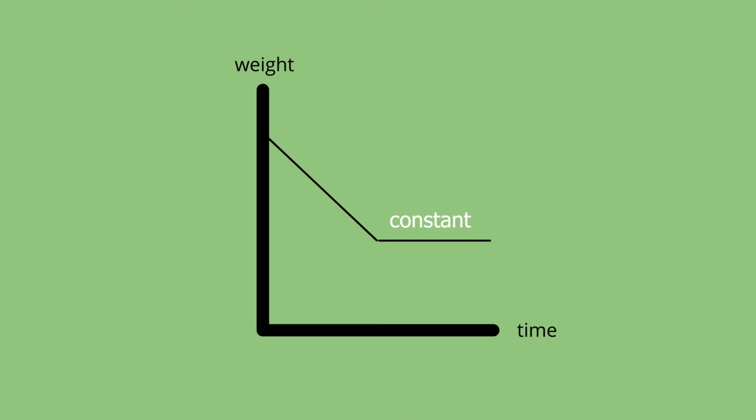Another one is the drying of the samples. The mass will go down slowly as time goes on, but it will eventually stop changing. That's because there's no more water. So we have to ensure that we dry the mass to a constant weight. Sometimes if you aren't looking at it for long enough, it could seem like it's just not changing. It might just be kind of fluctuating. Really, there might be a trend downwards. If we looked at it for a longer period of time, we would actually see that trend downwards. We're just too close to see that it's actually trending downwards.